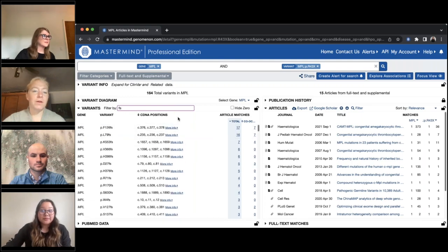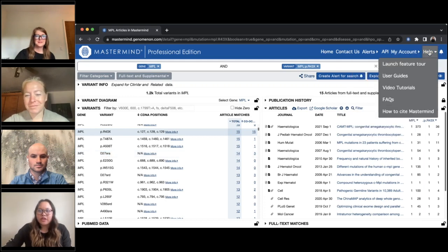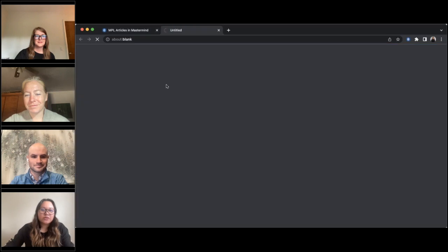And Denise, follow up on that one though. Where can they find all those? Those are pretty specific to us. So if they don't remember SD or whatever, how can they find that information? Yeah, great. So right here, SRA, I haven't talked about that yet. What does that mean? So you can go over here to help FAQs.